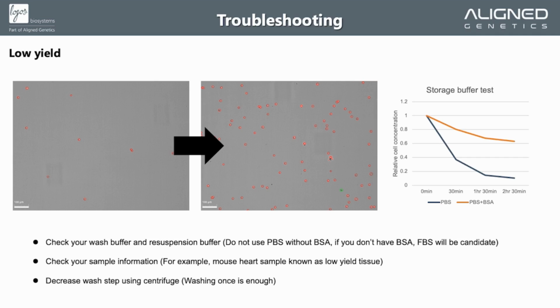These samples were stored in the same tubes, and the number of nuclei was counted to see the change in concentration over time. The results suggest that samples need to be handled as quickly as possible, as nuclei can bind to the surface of the tubes. So fast sample handling can prevent losing nuclei.